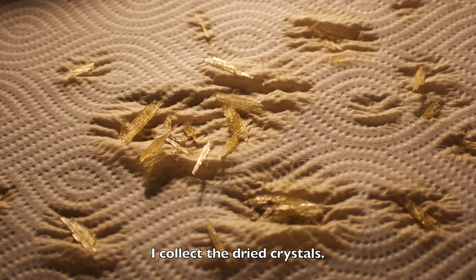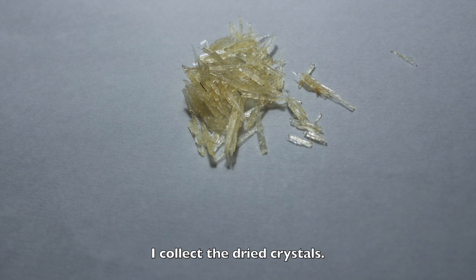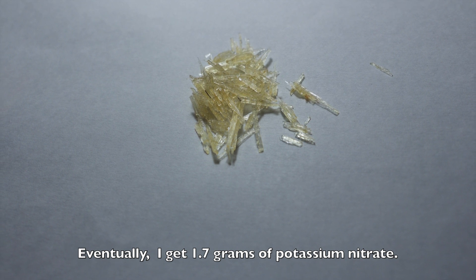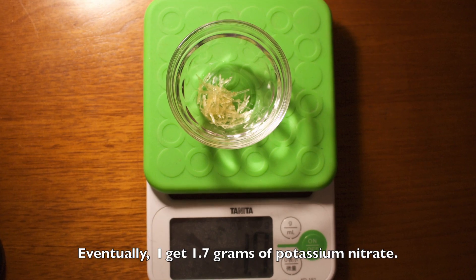I collect the dried crystals. Eventually, I get 1.7 grams of potassium nitrate.